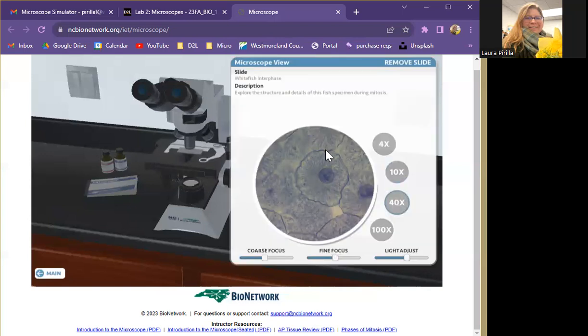So now you notice this one, the cell membrane of these animal cells, it's not so square and boxy. It's a lot closer to round and circular. And we don't see any of those little green polka dots because fish don't produce their own food from sunlight. I think you probably knew that. But we do still see a big nucleus in the middle where the DNA would be stored.